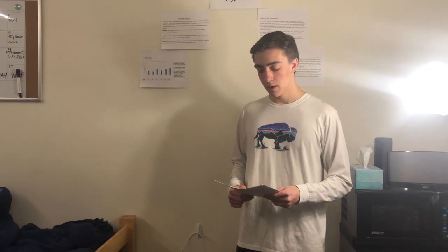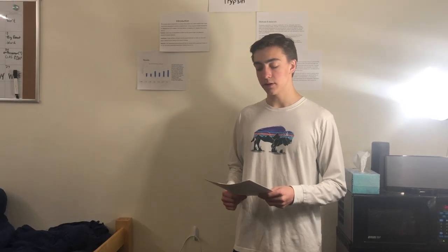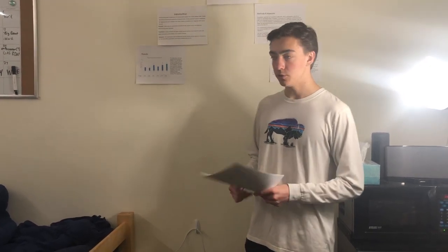Another source of error in our experiment could have occurred during the mixing of the pH solutions. Because we used increments with our solutions, we're not 100% sure if we were actually at a pH of 7.5 or 8.5. It could have been a little higher, a little lower based on human error when it comes to measuring.